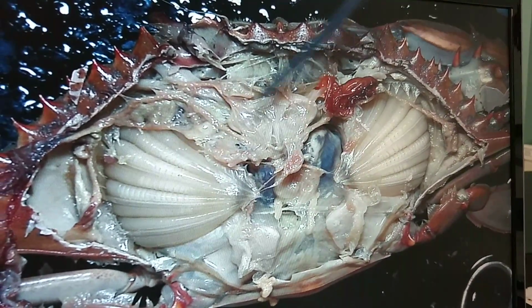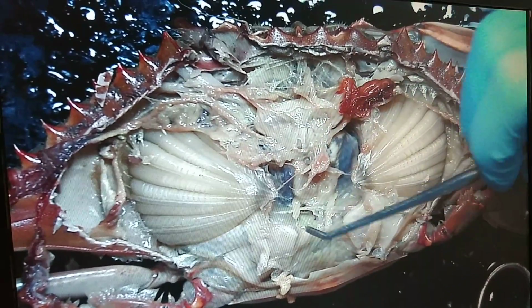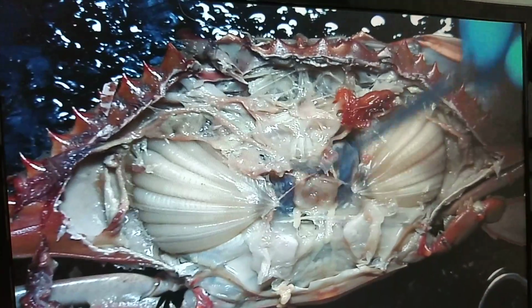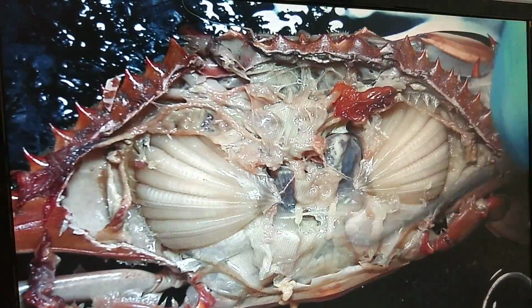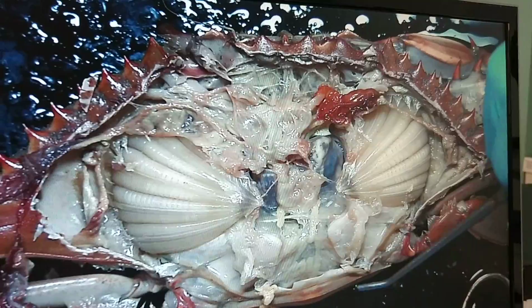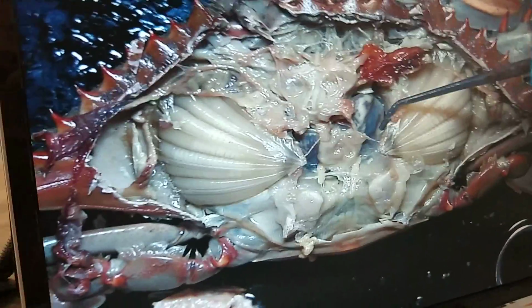That's the stomach right there. That's the cardiac stomach? Yep. Can we see the pyloric stomach? The pyloric is going to be underneath. Yeah, probably not going to. And I don't think you need to see the pyloric stomach, but I wouldn't worry about it on this one. Okay. It's a female, so it doesn't have vas deferens.